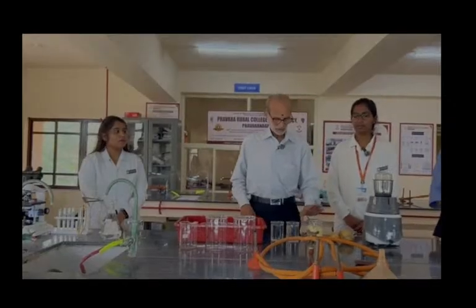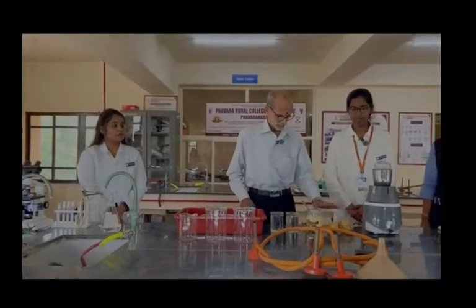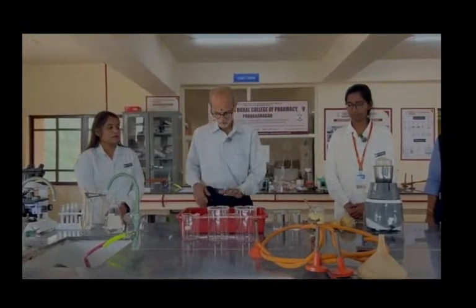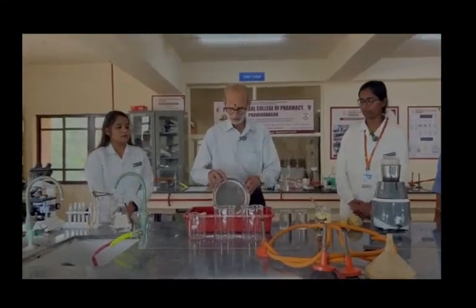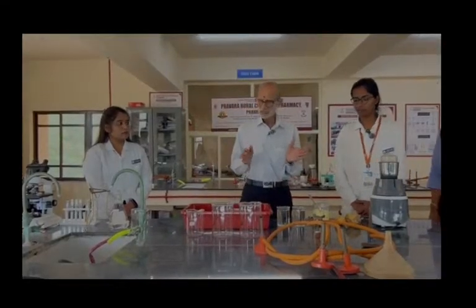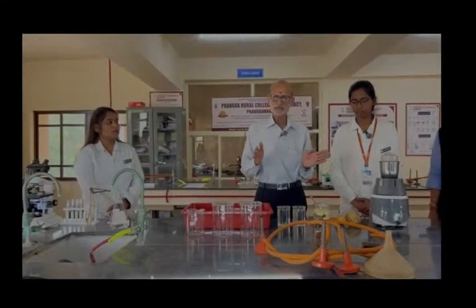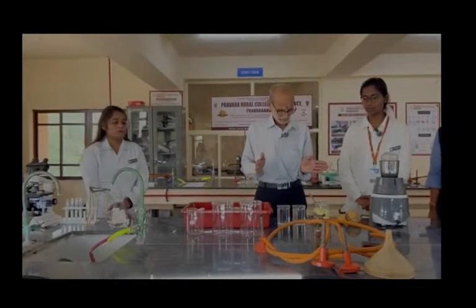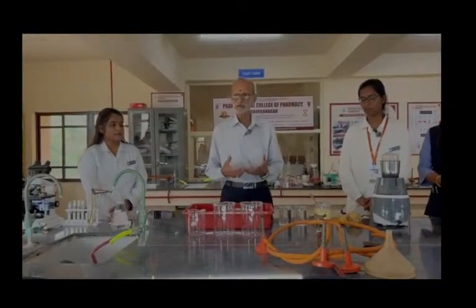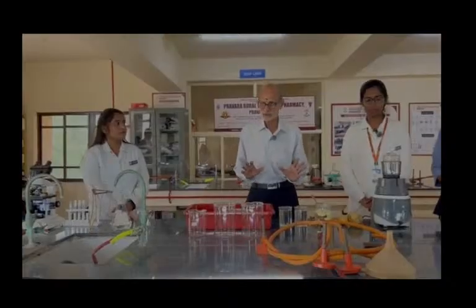We are going to make it from the pulp in a mixer. Bhakti is going to do that, and thereafter we'll be passing it through the mesh. Now the mesh which we are using is about 60 mesh, and the starch grain of the potato is about up to 100 micron in diameter, so it will pass through it, whereas the cellulosic material remains behind. Potato contains around 17% of starch.